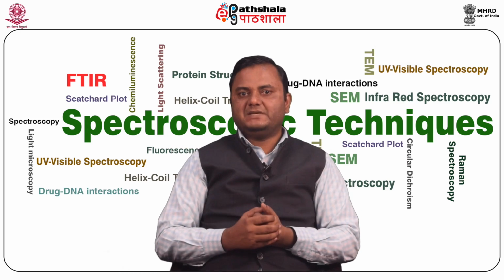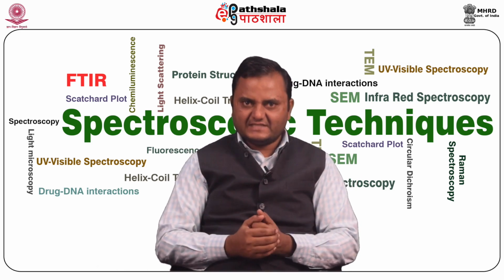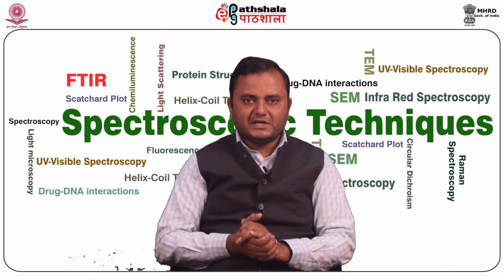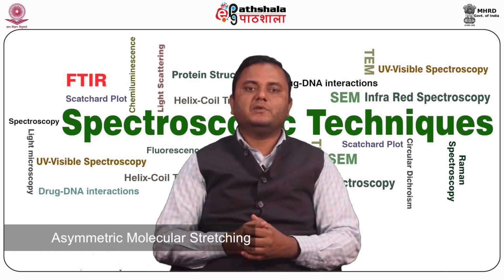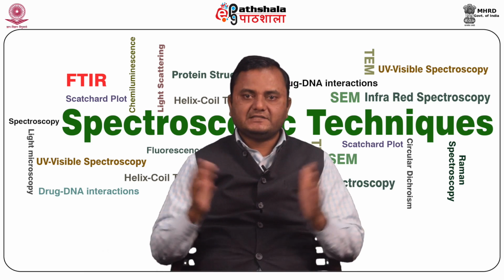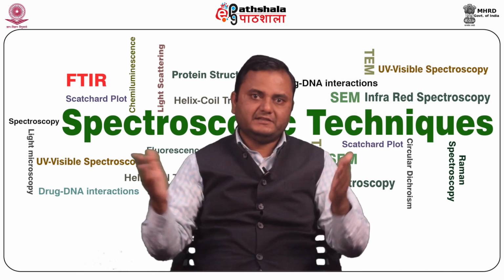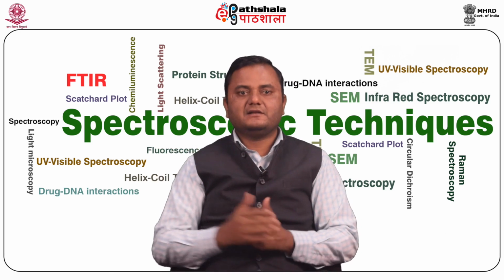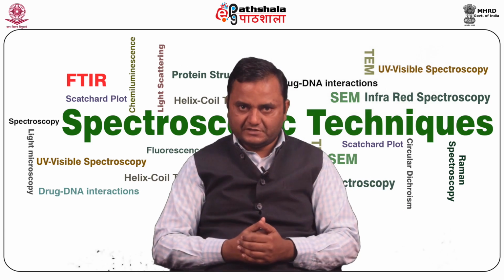Let's start with the basic principle of Fourier transform IR spectroscopy, that's termed as FTIR spectroscopy. FTIR spectroscopy is a vibrational spectroscopic technique, meaning it takes advantage of asymmetric molecular stretching, vibration, and rotation of chemical bonds as they are exposed to designated wavelengths of light, mainly in the IR region. The Fourier transform is to transform the signal from the time domain to a representation in the frequency domain. That's the main advanced feature.